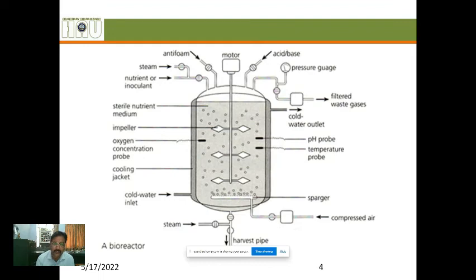But exactly two-thirds is around 66.6%. So usually, when we are handling any bioprocess, it's 70%, and 30% of the area is kept free from the medium so that it will not touch any of the gasket or the ports, which are usually the source of contamination.